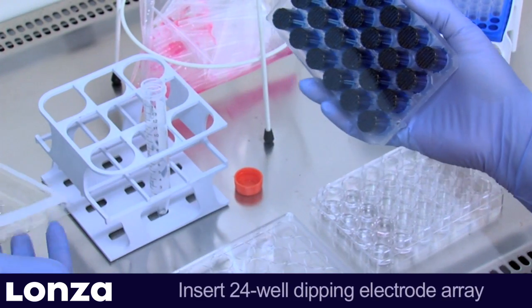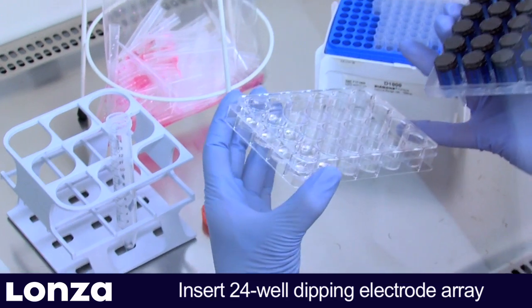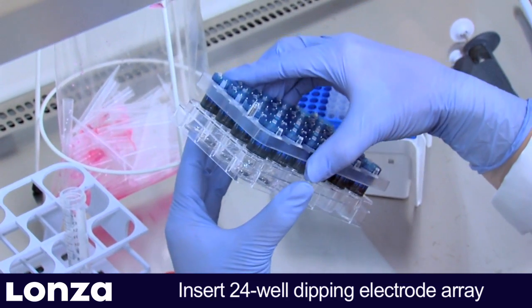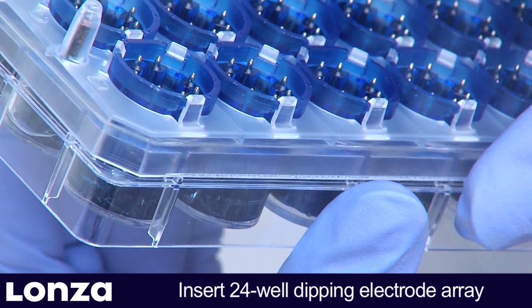When inserting the dipping electrode, make sure to use the correct orientation and avoid bubbles underneath the dipping electrode. It is best to hold the plate at a 60 to 75 degree angle.